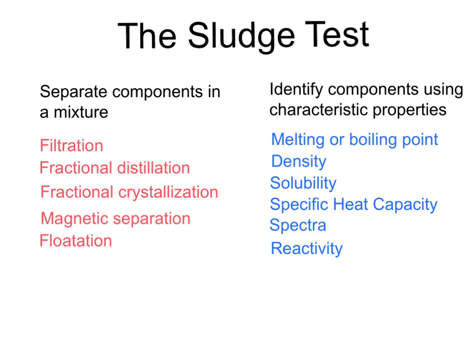Spectra, we've done a number of times. This is when you get a small sample and put it in the flame. Remember that to get the spectra, you need to get your substance to dissolve in a liquid first so that our alcohol burners will be capable of giving you a colored flame.